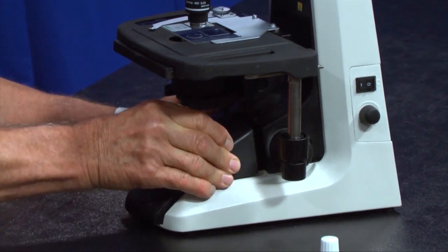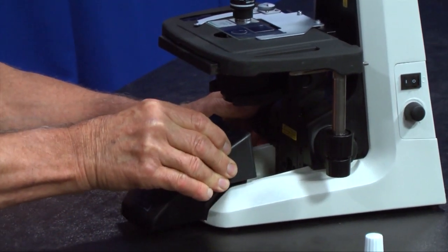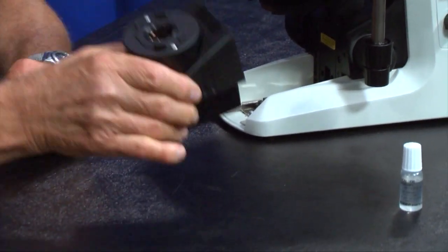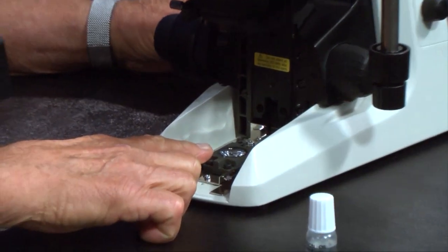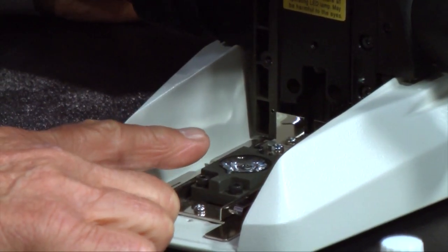Nowadays, most of the microscopes being sold use LED bulbs, which is not actually a bulb. It's a light emitting diode, a little circuit that takes the place of the bulb.